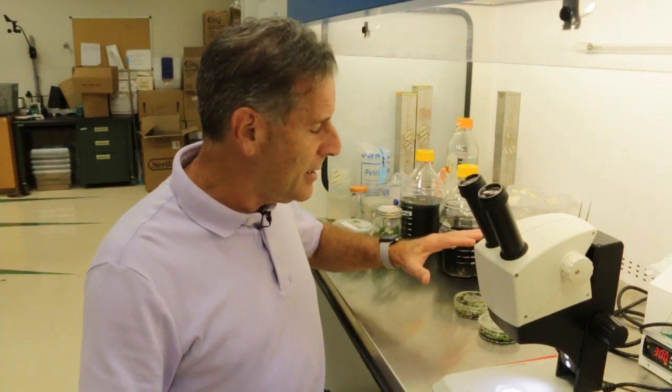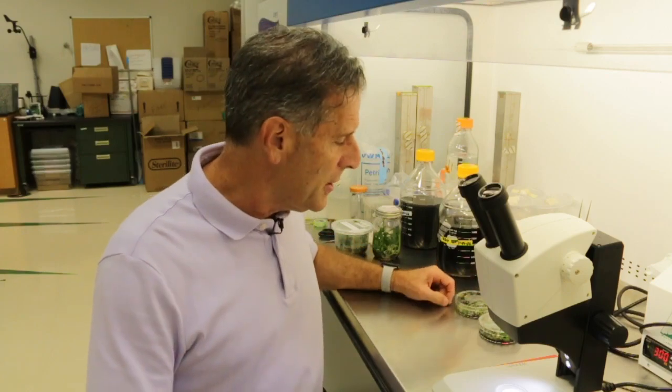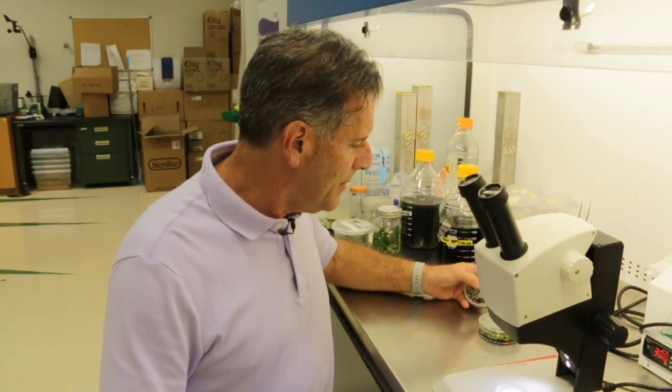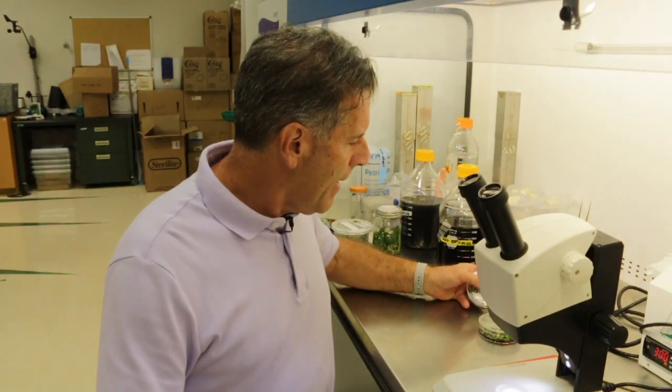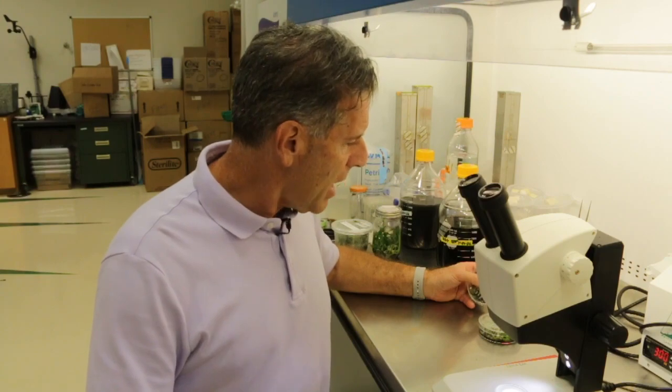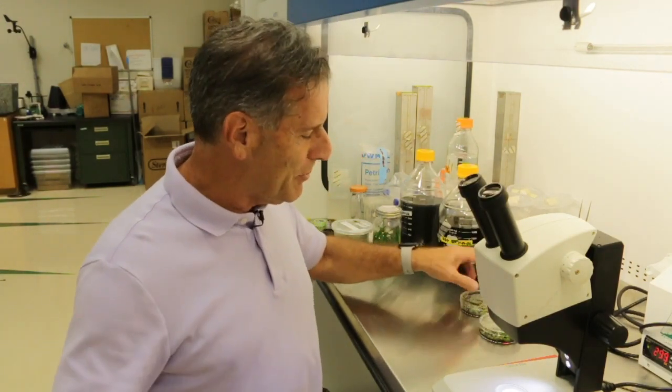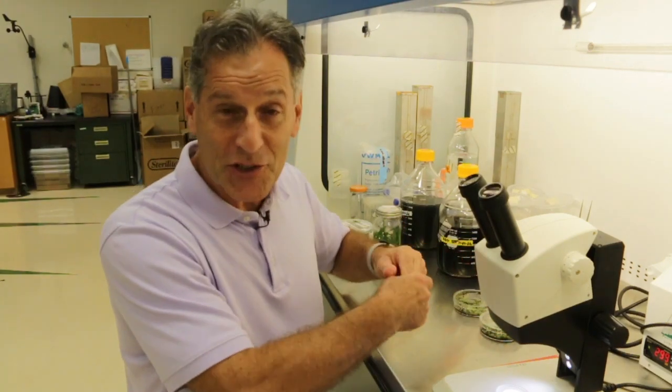I then went back to the original plates that contained the plated seeds, and these were done, I guess, about 6 months ago. Yeah, actually 6 months ago these original seeds were plated, and I have two of the original dishes here.